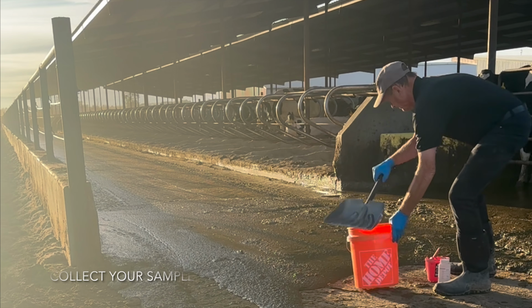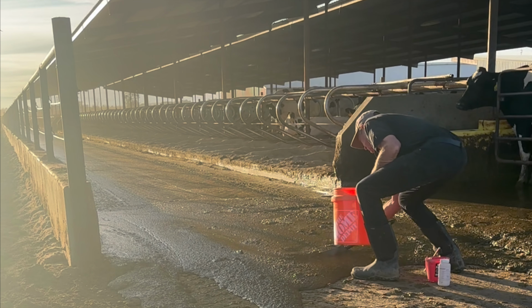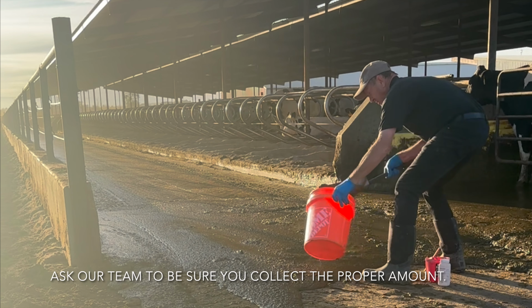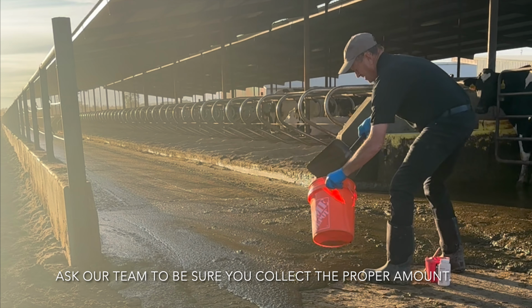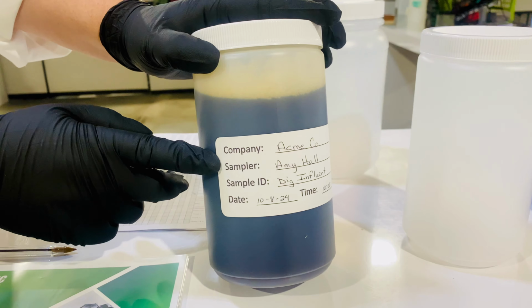The next step is to collect your organic sample. Be sure to collect enough for us to run the testing you've requested. If you have questions about sample volume, please reach out to our specialists for guidance. Please avoid using glass containers for your samples.